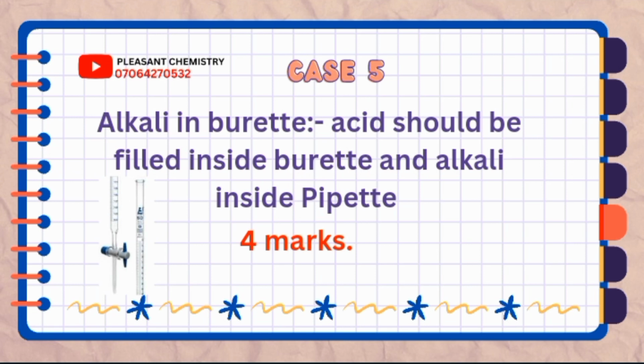So in this case, you are to ensure that you put acid inside your burette and you pipette your base with a pipette. Failure to do that will attract -4 marks.